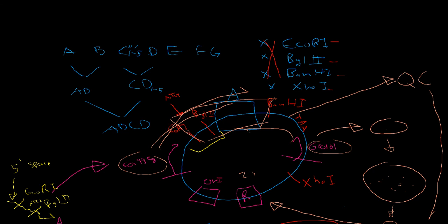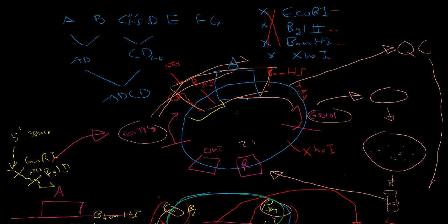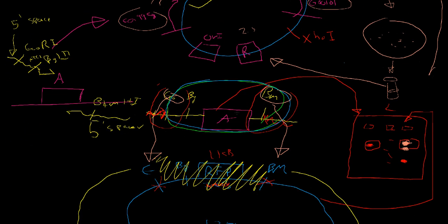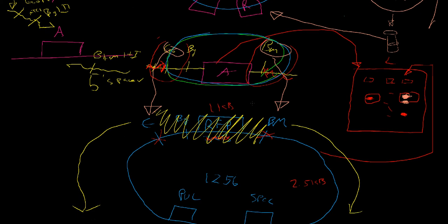Then once you've QC'd it, you're just going to make sure that it's well annotated. You have a tube that is very well documented that has been QC'd, and you have a record of that QC. Then you can go into the assembly, and we're going to talk about how we assemble basic parts next.